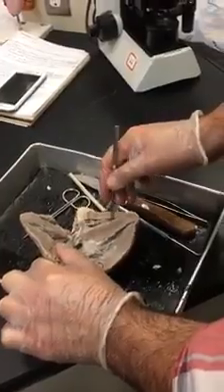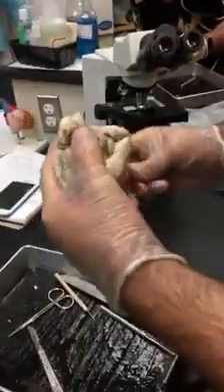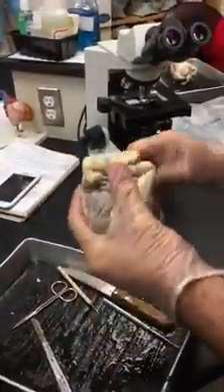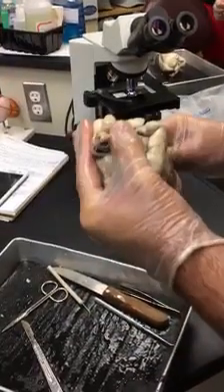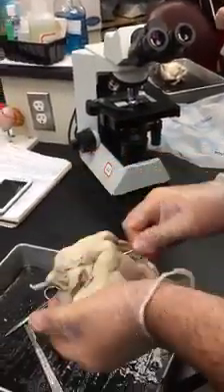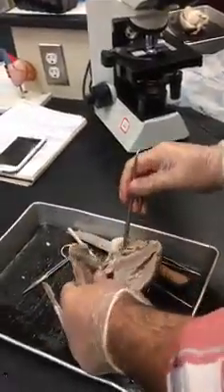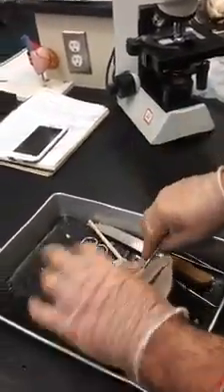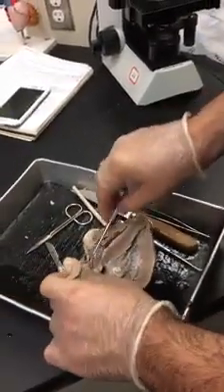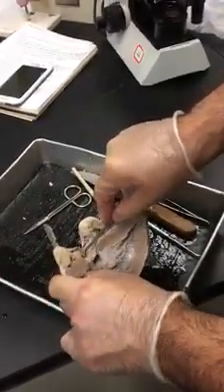The right ventricle — if I go through it, I should end up in the pulmonary trunk or the pulmonary artery. Above it we have the tricuspid valve; these are the flaps of the tricuspid valve.